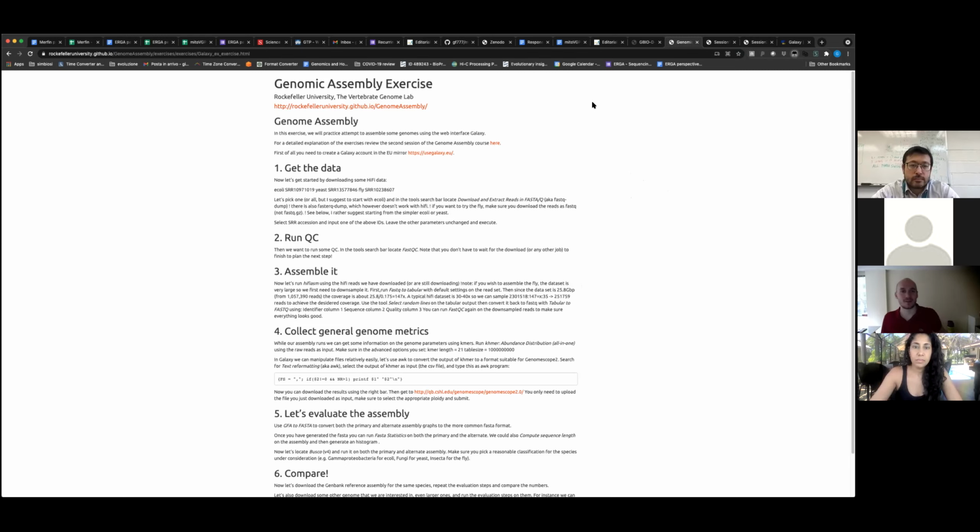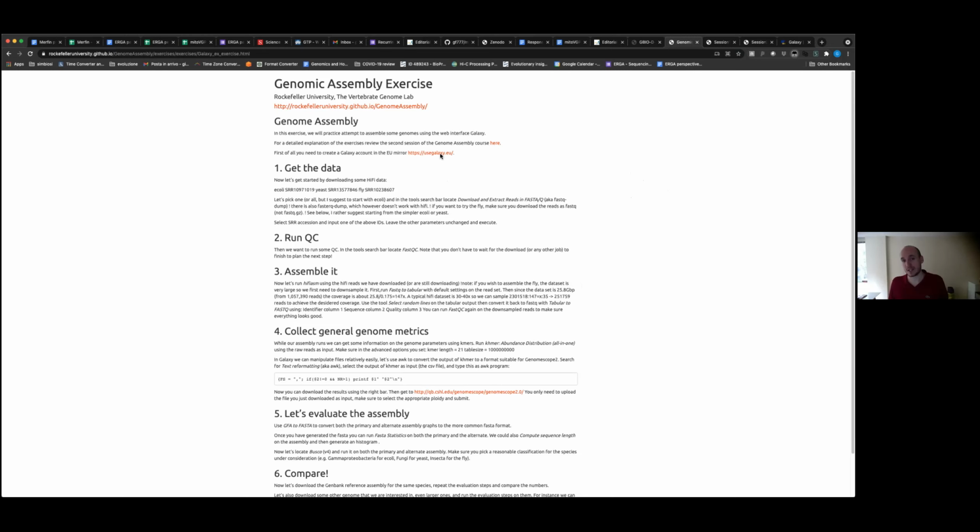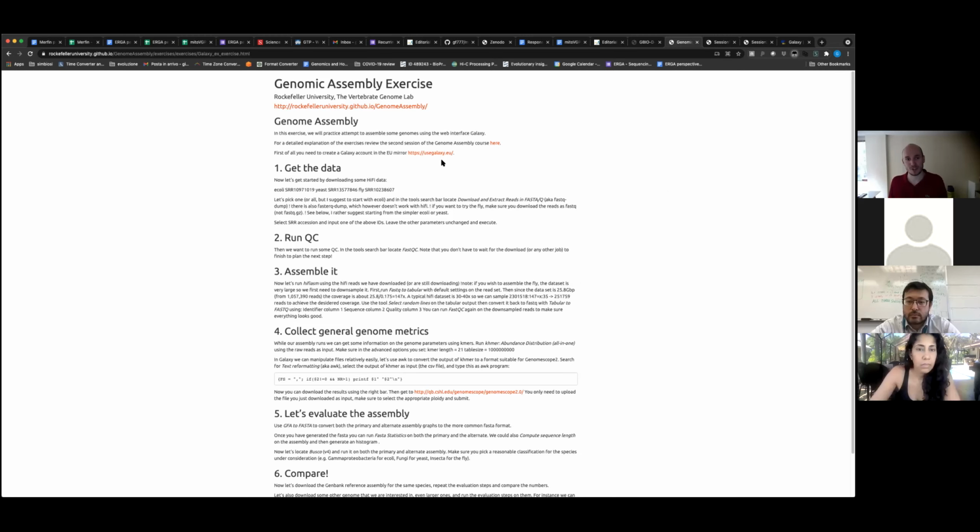I would do it in a... So here you basically have dissected all these steps. They're not concatenated. Of course, you can do it manually, and you did for sure. But especially if you have a pipeline already in mind, there are more efficient ways to do that. So I'm going to try to do it with you in such a way.